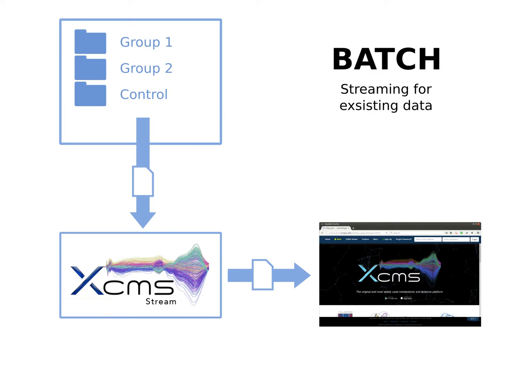If you already have data available to upload and analyze, you can use Batch Mode. Just point the data acquisition directory to where the files are. Both of these modes have the added benefit of automation. Job submissions are automatic and it eliminates long and tedious manual uploading of different datasets.